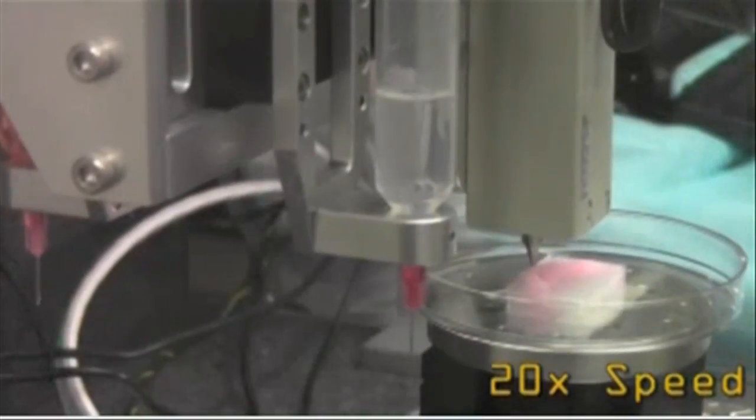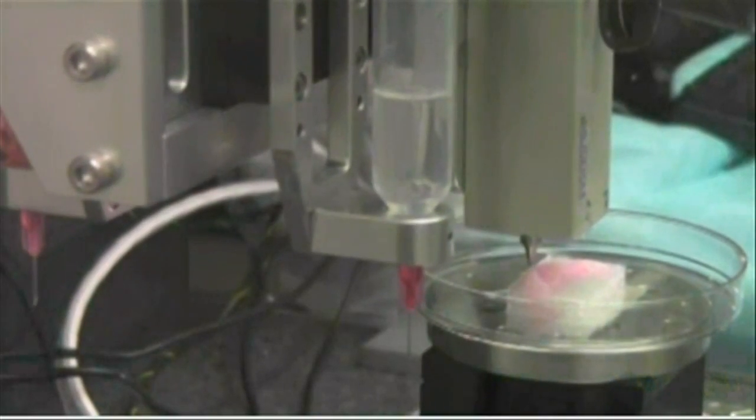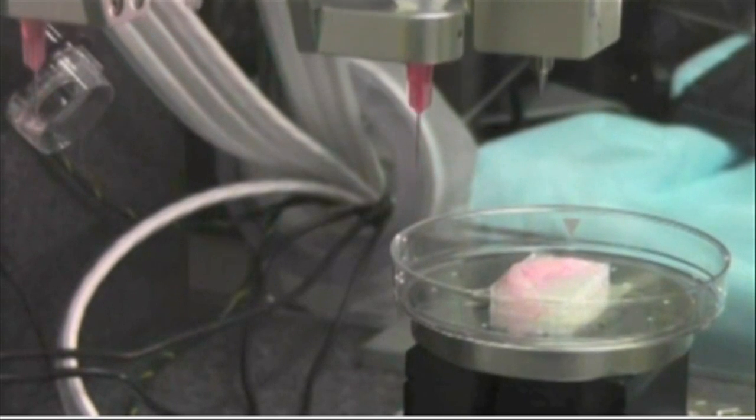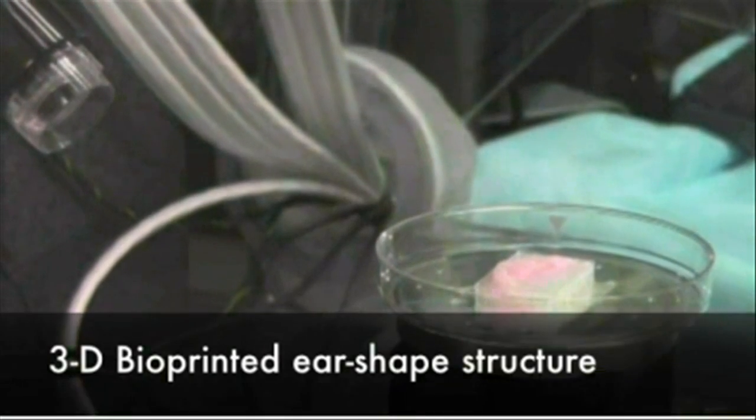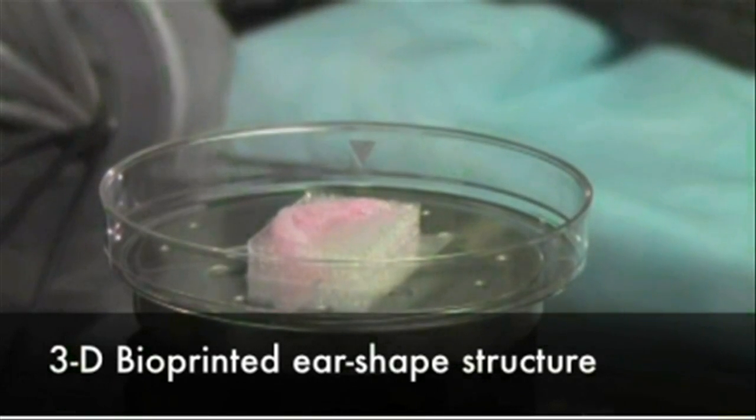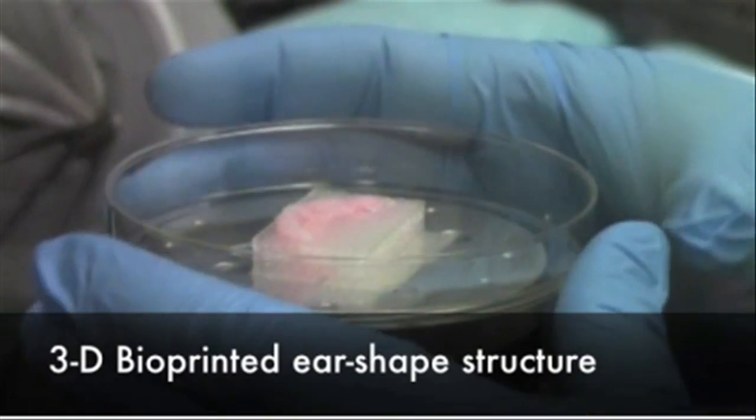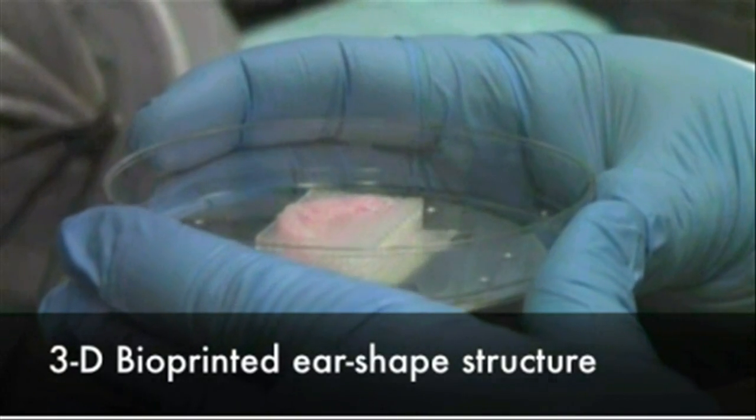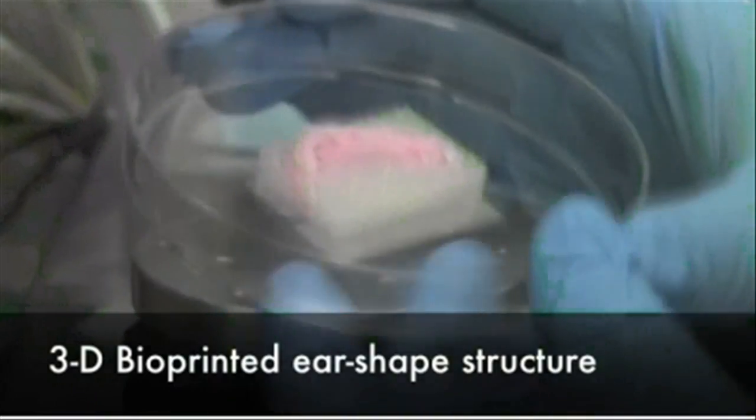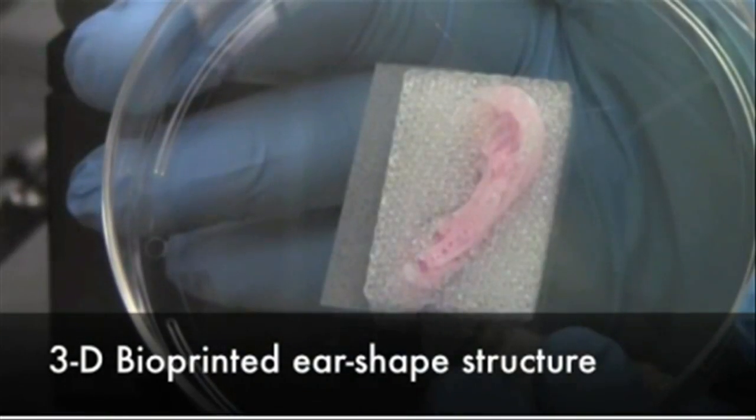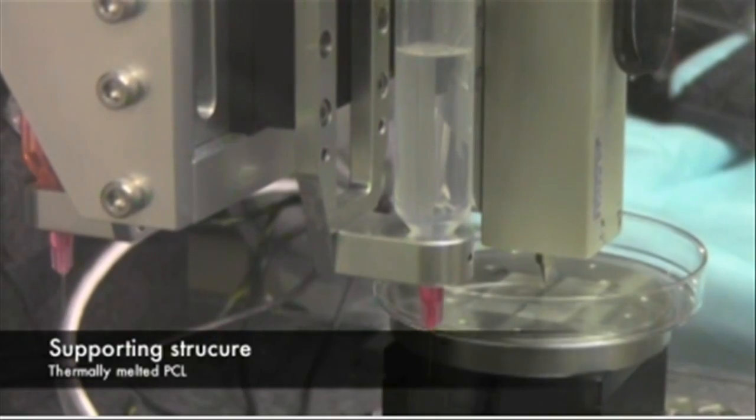The system deposits both biodegradable, plastic-like materials to form the tissue shape and water-based gels that contain the cells. In addition, a strong temporary outer structure is formed. The printing process does not harm the cells.